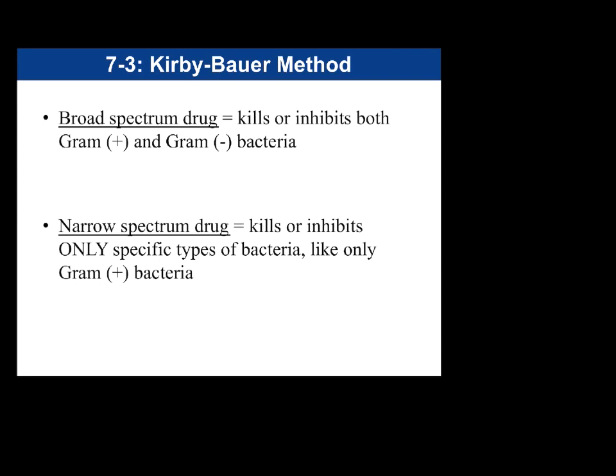The narrow spectrums are going to be used, I would say, less frequently because you really need to target what type of infection, versus a broad spectrum you may see used a little bit more often because it's going to target a number of different types of cells.